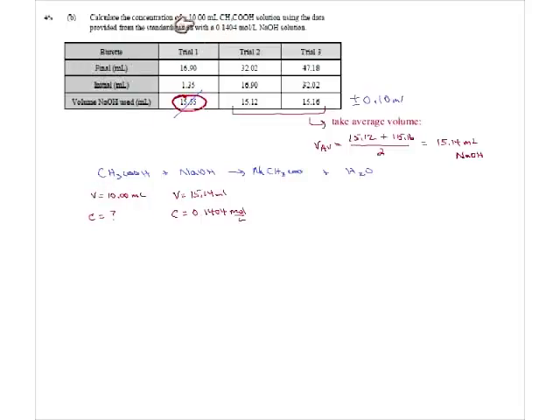We know the volume of acetic acid we used. We used a 10 mL pipette. Very accurate. We were very careful. We used the perfect aliquot. We just don't know the concentration of this. So this is some simple stoichiometry, where we can calculate the number of moles of sodium hydroxide, n equals C times V. We put our values in and calculate it, very accurate now, it's 4 digits.